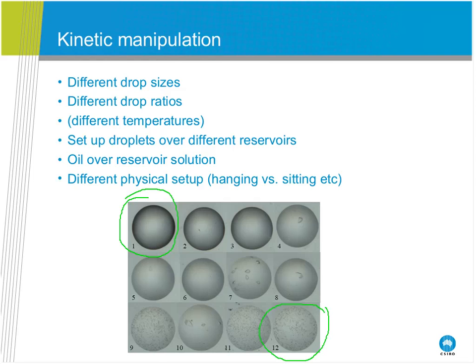And actually you can see that across this gradient, as you move across here, you go from being undersaturated, beautiful crystal, and then you can see this is a really good indication that the phase space is not smooth, because we get a crystal, then we get no crystals, we go back to crystals, microcrystals, back to large crystals, and then microcrystals again. And so it's a really nice indication that phase space isn't smooth, but this alternative reservoir gradient screening is a really very, very nice way of moving between microcrystalline and single crystals.